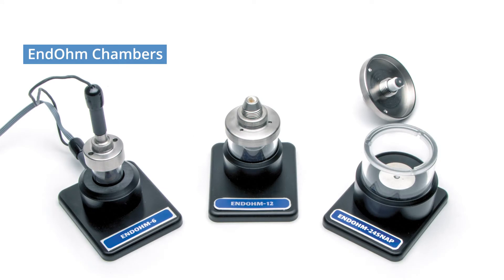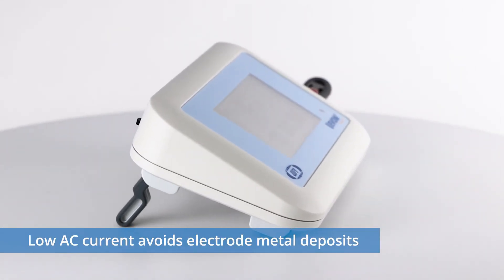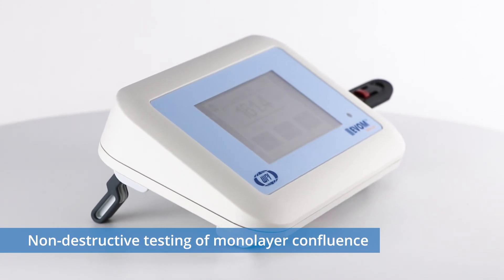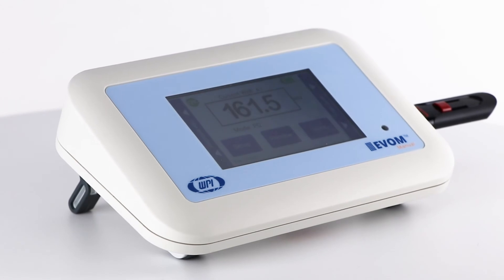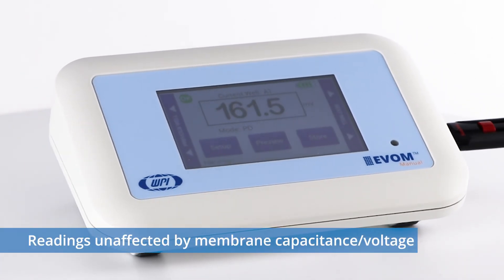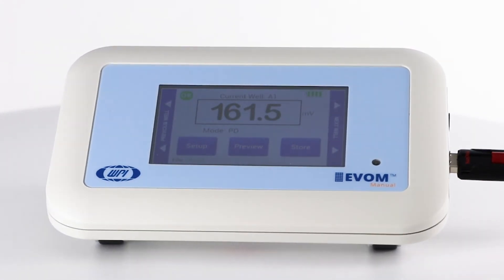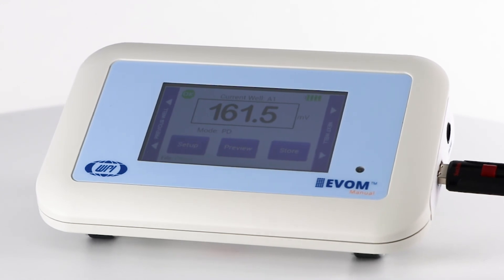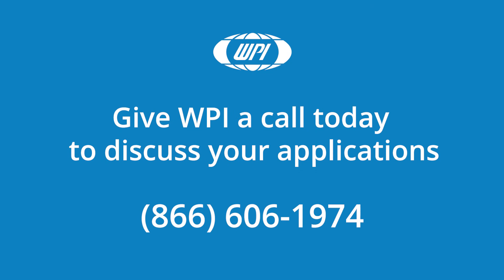The end-ohm chambers are popular for higher measurement accuracy. The EVAM Manual produces a low AC current that avoids electrode metal deposits and is specially designed for the non-destructive testing of epithelial monolayer confluence in cellular cultures. Additionally, resistance readings are unaffected by membrane capacitance or membrane voltage. WPI's state-of-the-art EVAM technology provides you with real-time, valuable data during experiments. If you have any questions, just give us a call.